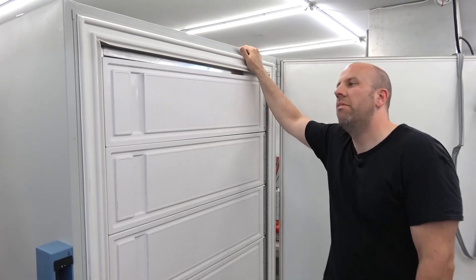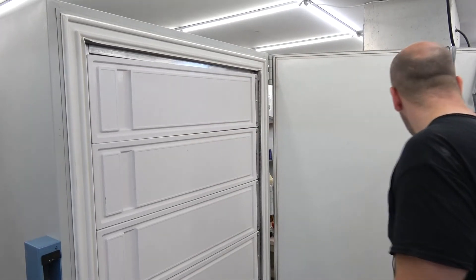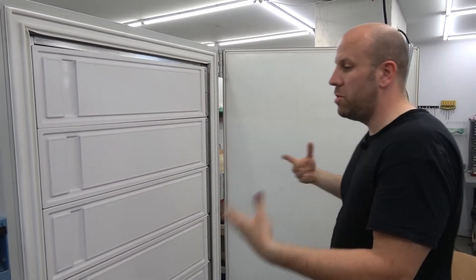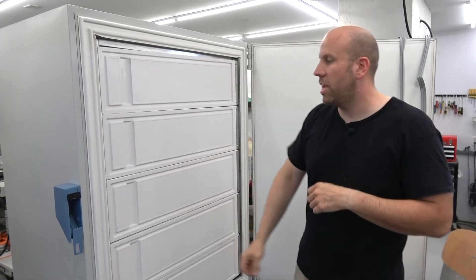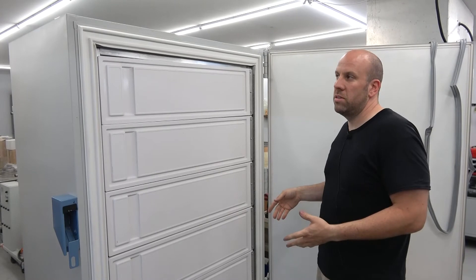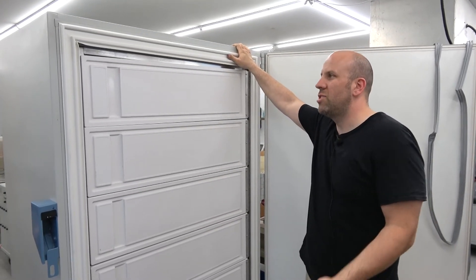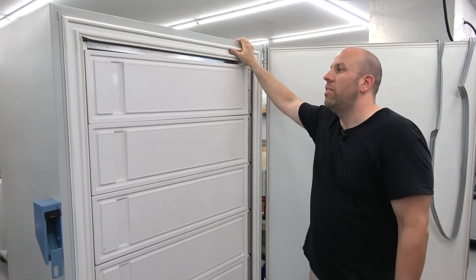I would recommend letting it dry — close it, put pressure on the seals just like you were normally using it, close it, latch the handle, and let it sit for 24 hours before turning the freezer on. That gives the silicone time to cure, which usually takes 24 hours, and then you're good to go.